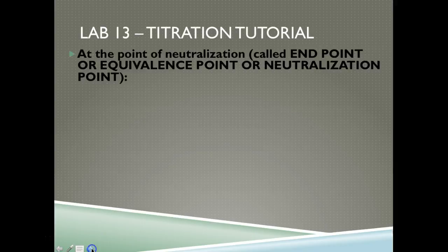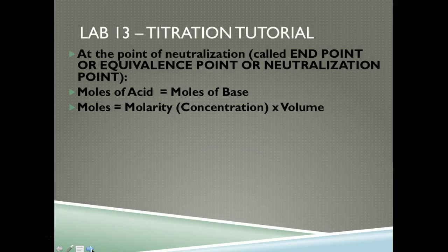So it'll look something like this. You'll reach the end point or the equivalence point or even the neutralization point. They all indicate that the moles of acid is equal to the moles of base at this point. So this is where you've reached the end of the reaction.